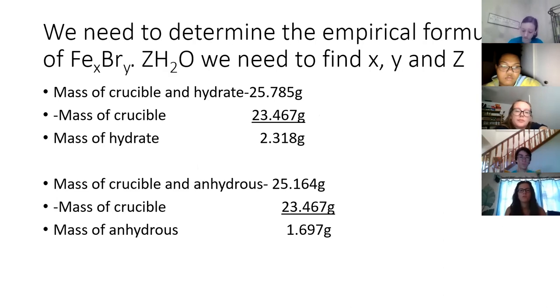I don't know, Taylor. It's a perfectly good example, good answer. If it's not obvious, then this is the first time you had this. There's no reason for you to know it. What's that? You heat it? I've already heated it, and when I heated it, what did I get the weight of? The hydrate? No, I didn't. The weight of the hydrate was before the heating. After you heated it, I got the weight of the anhydrous.